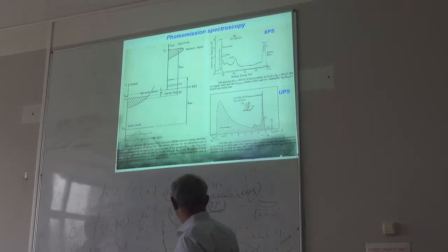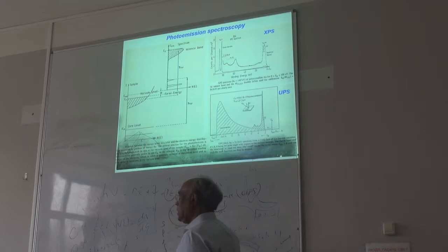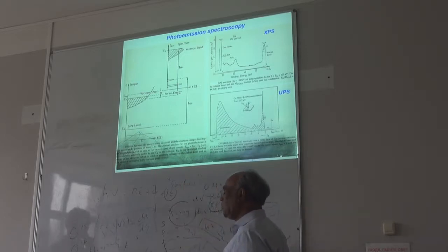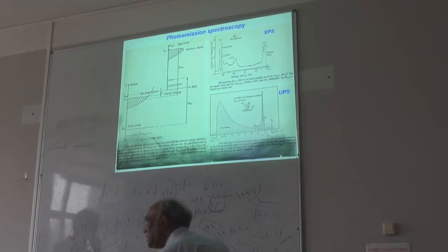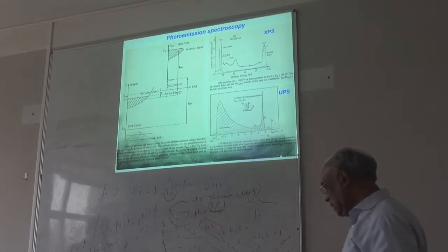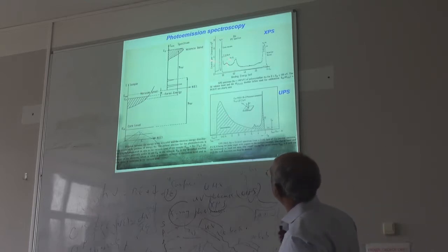So this is in the same instrument. We have another chamber, like instead of X-ray, they have a UV source. So we just shine UV light on the sample and look at what is coming out, again using the same detector. You can look at the outgoing energy from the UV light. In the UV light situation it is different, because UV light only excites valence electrons, not the core electrons.